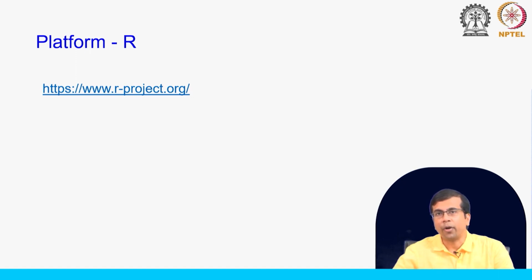So, from that point we can now take this forward in the R platform. Okay. So, HISAT2 runs on the terminal of Linux, and HTSeq count we also used in the terminal. From there on we can now use the R platform to do all the analysis that we would like to do. Okay.